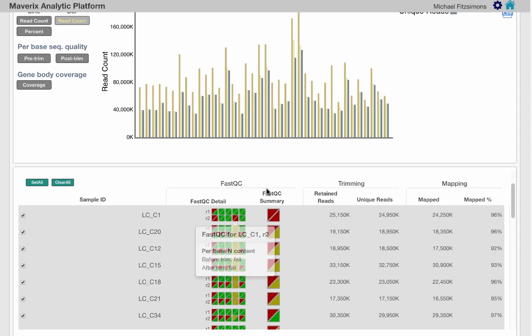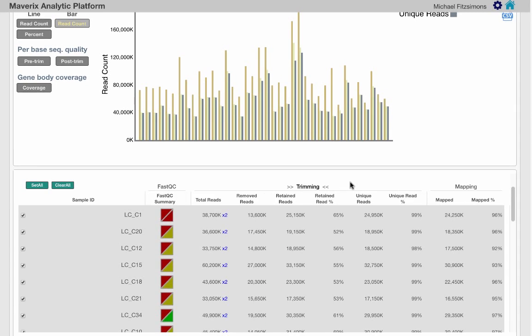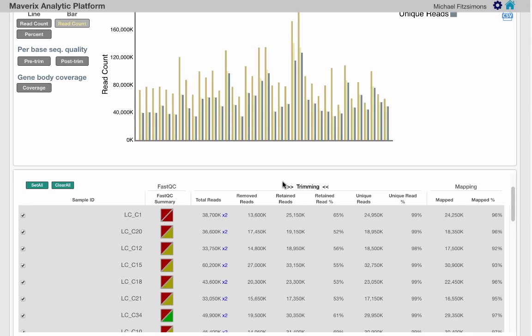The central region in the table includes a set of results pertaining to the quality of your data prior to mapping. Here you see the total reads, reads removed due to low quality or adapter sequence, reads retained, and unique reads.